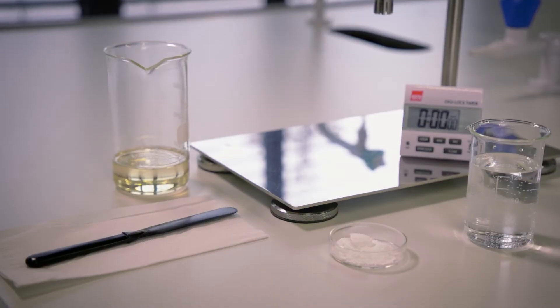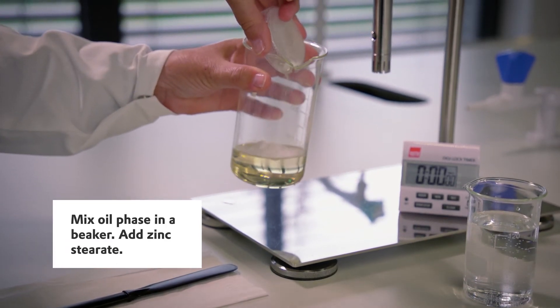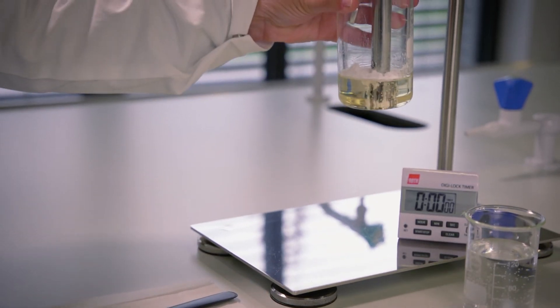In the first step, you mix all the ingredients of the oil phase in a beaker and add in the second step the zinc stearate. This can be done at room temperature, which saves energy and which saves time.